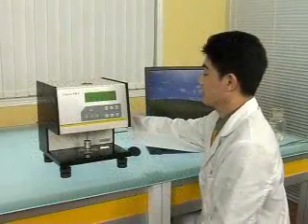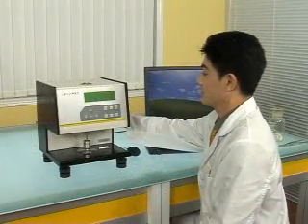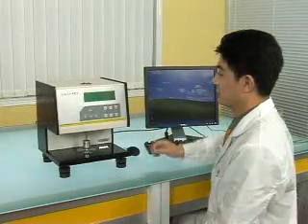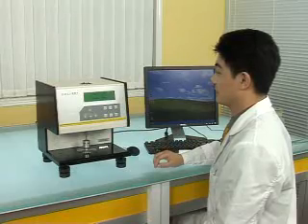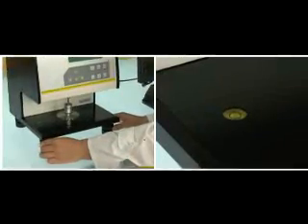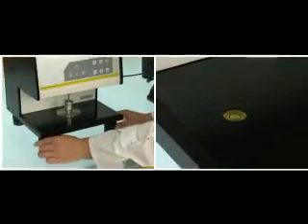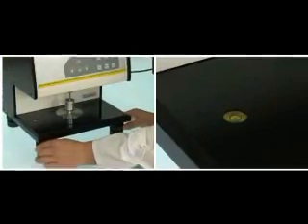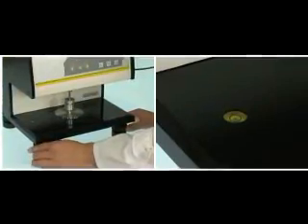Turn on the power switch of the mainframe. Warm up the instrument for 30 minutes. Turn the four leveling ports of the instrument to adjust the bubble to the center position.